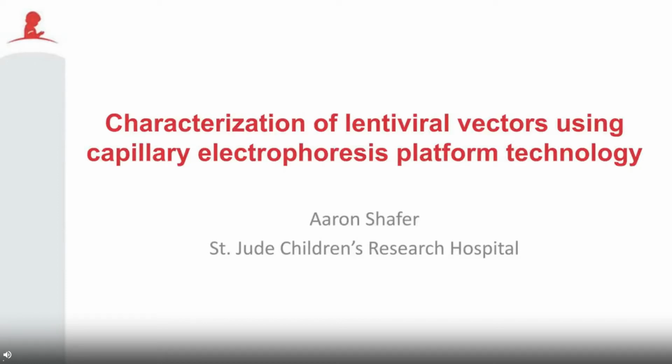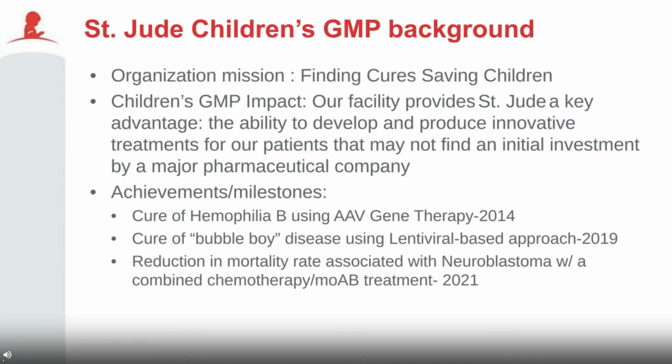Well, first of all, I just want to thank you for that brief introduction. Today, I will be talking about the characterization of lentiviral vectors using capillary electrophoresis as the platform technology. Before we dig into the talk, I did want to give you some background about St. Jude Children's Research Hospital, which is where I work. I work here at the Children's GMP, which is actually part of the hospital itself.